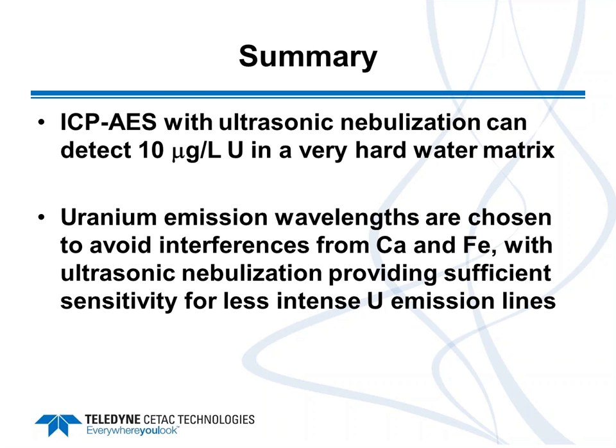Okay. Do you see any memory effects by using Tygon rather than Teflon tubing for the sample line? There can be if you're collecting more salts that may stick to the walls of the Tygon. Most of the memory you will see with the USN can come over time in the heated part of the J tube.